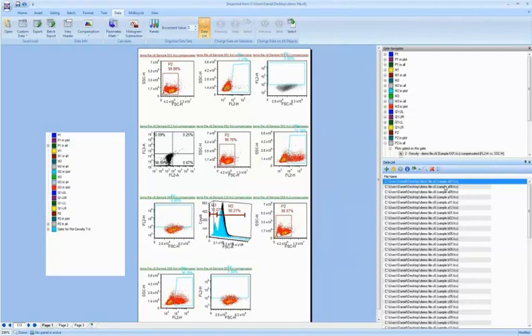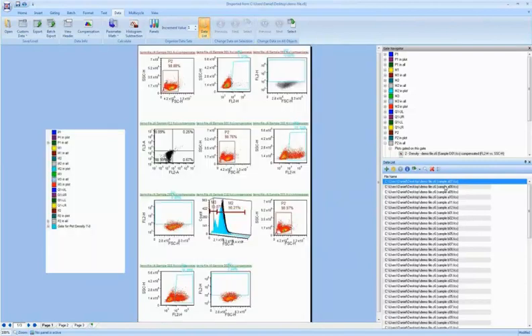Now, being able to see all of these different data files is very useful because this data list is actually what gets used in batch processing. And so if you want to scroll through a number of different plots, either just on the page or while exporting statistics, then you would do that by setting up the data list. So when you import using the CFlow importer, the data list gets set up properly for you.